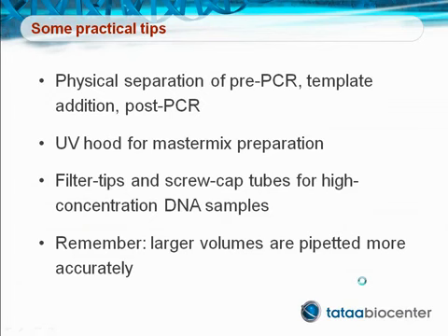When setting up qPCR in a laboratory, it is advisable to physically separate spaces for pre-PCR work, template addition, and post-PCR to minimize contamination risk. In our laboratory, a person analyzing PCR products in the post-PCR space is not allowed back to the pre-PCR area that particular day.